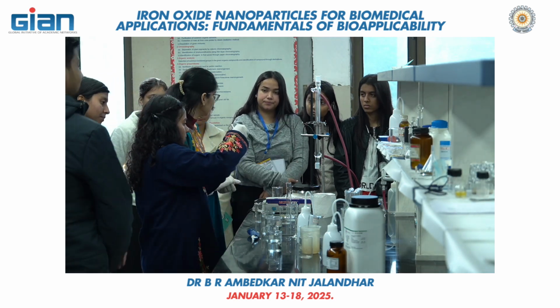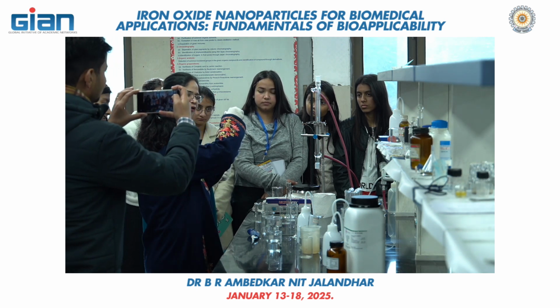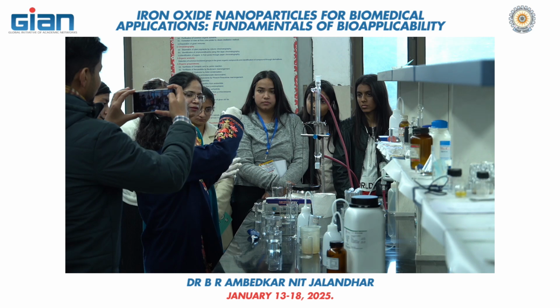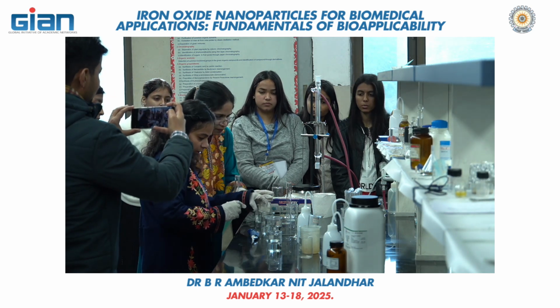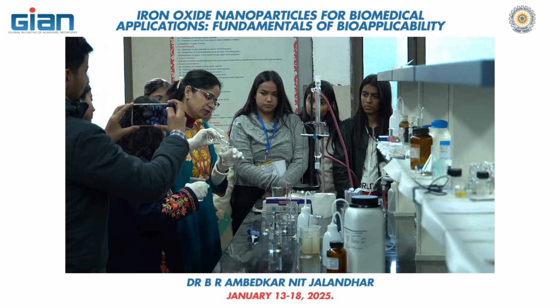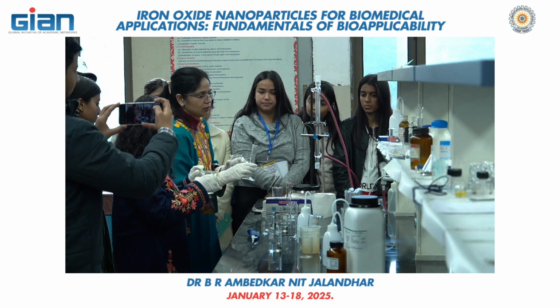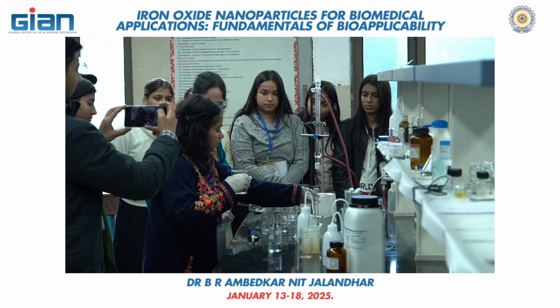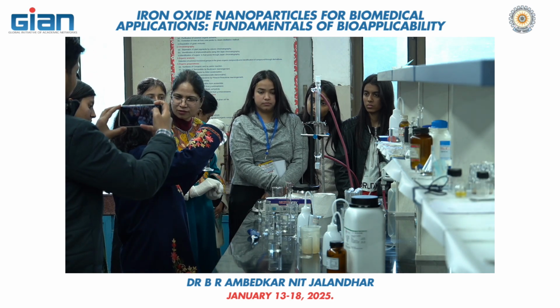Now we have the aurichloride. We are using it at a lower concentration, 0.25 millimole, not mole, millimole. 1 gram is 25,000, what is the cost?